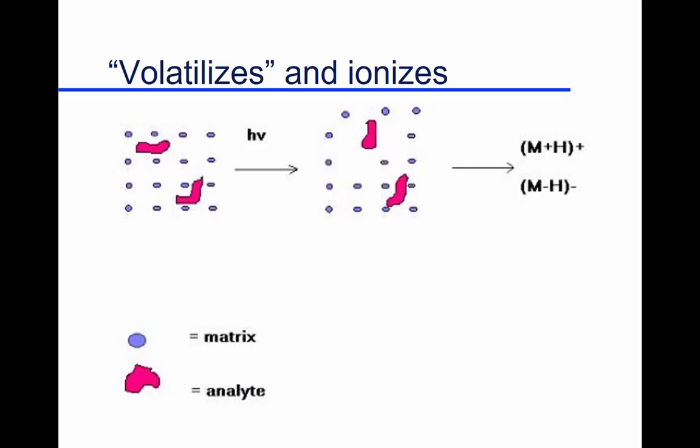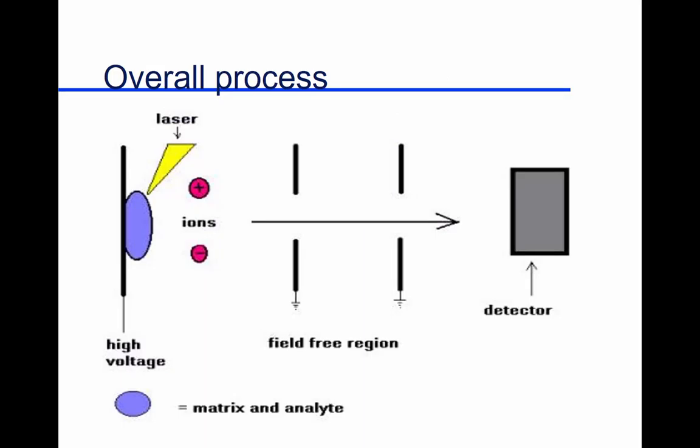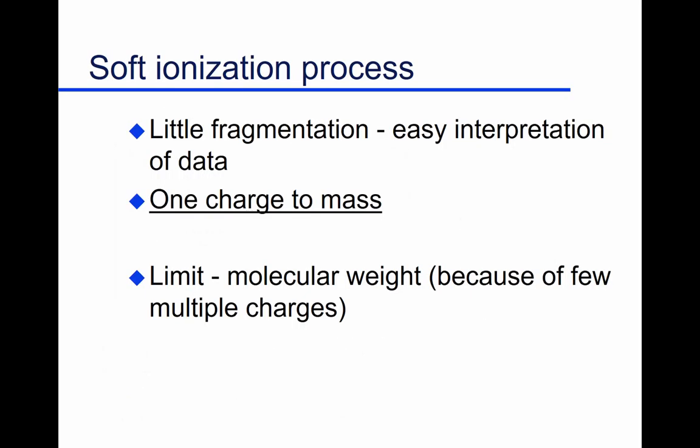And this shows an example. Here's your matrix with your analytes in. Not a really good example. This basically should be blowing this out in one way or another, separating it from that matrix, which you then go ahead and analyze. This is just a little different view of it. Here's your sample in your sample matrix, hit with the laser, which vaporizes that matrix and expels ions that get drawn down, separated and detected. Little fragmentation, so it's a gentle means of doing this ionization.